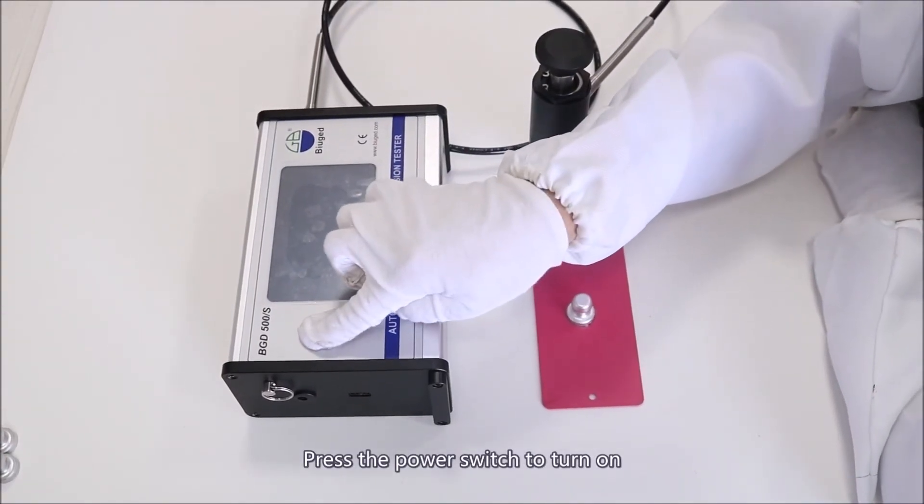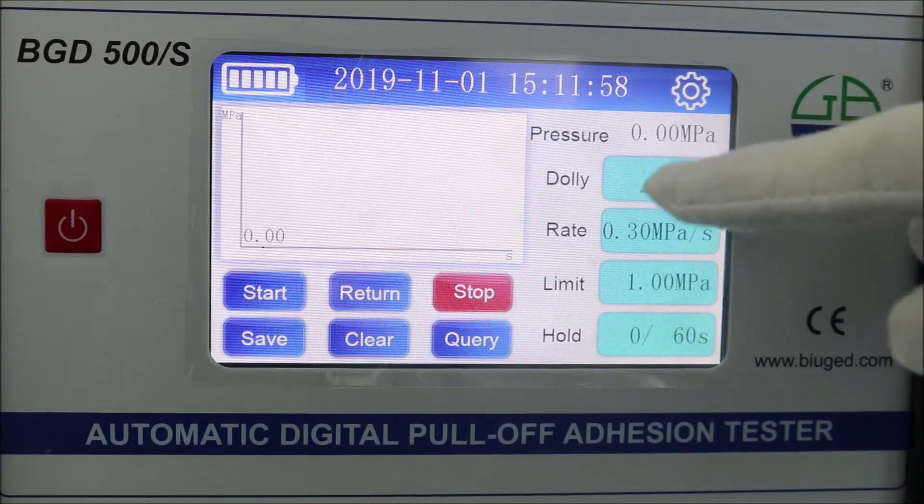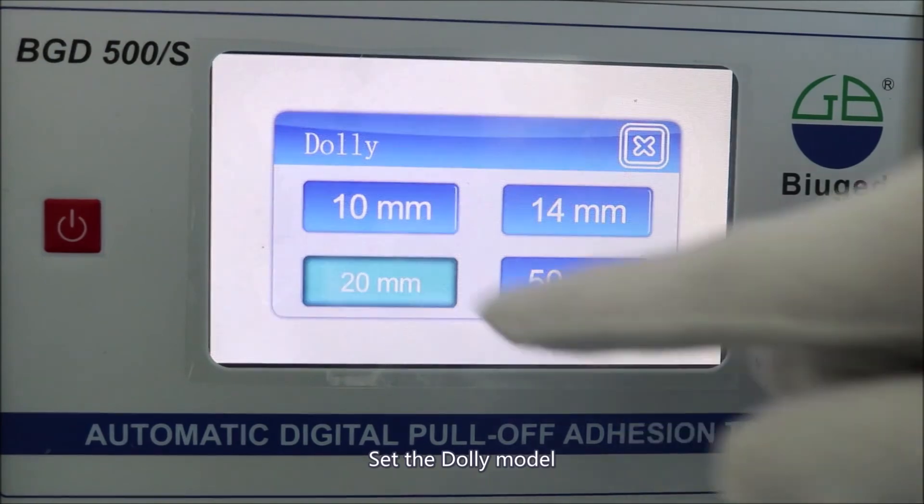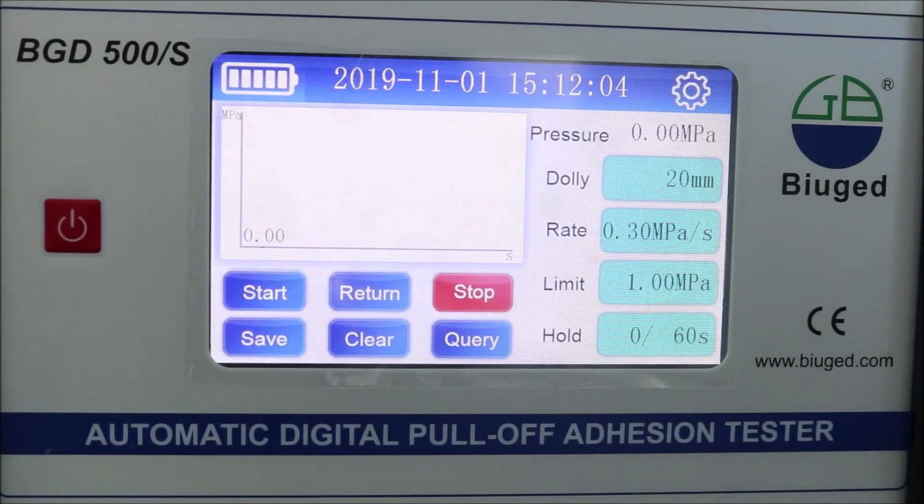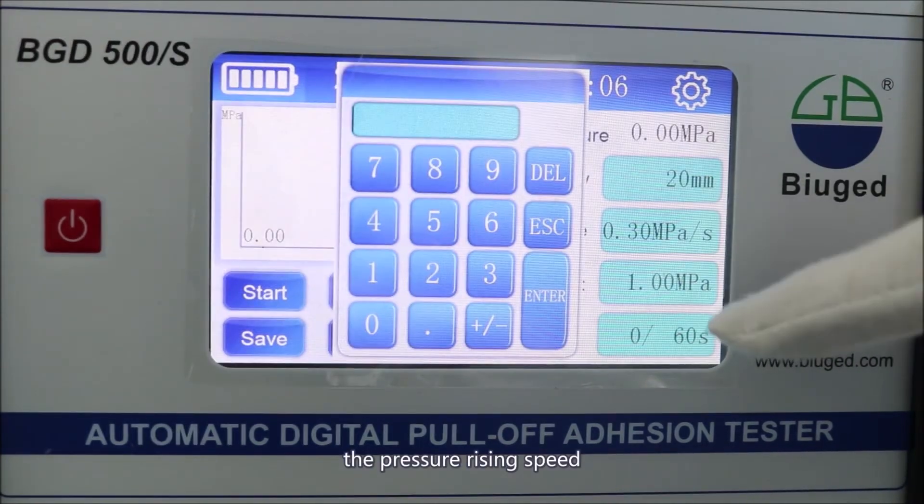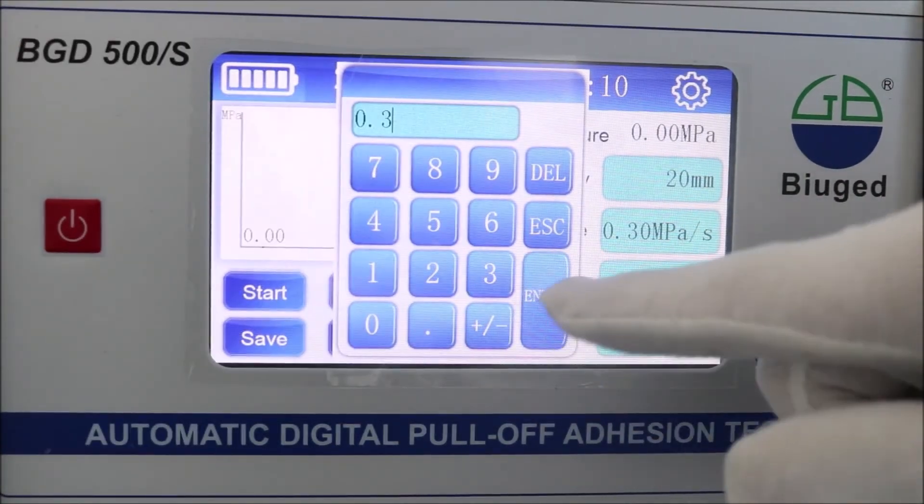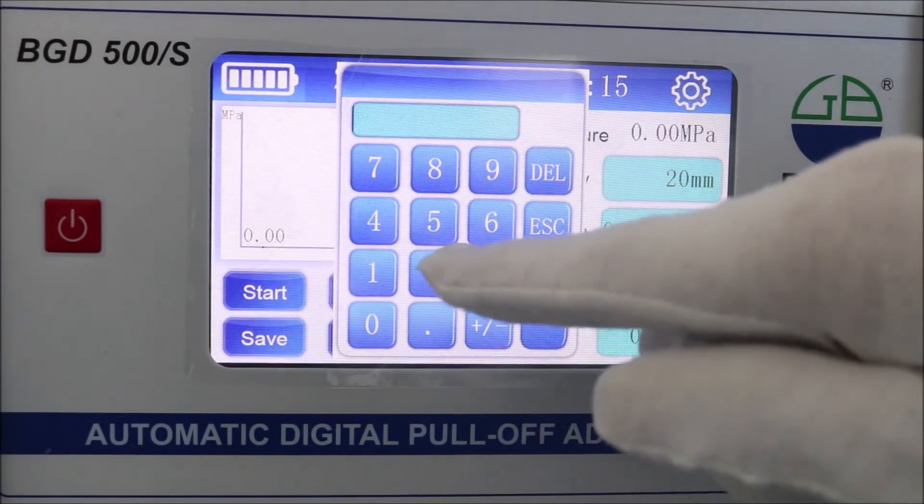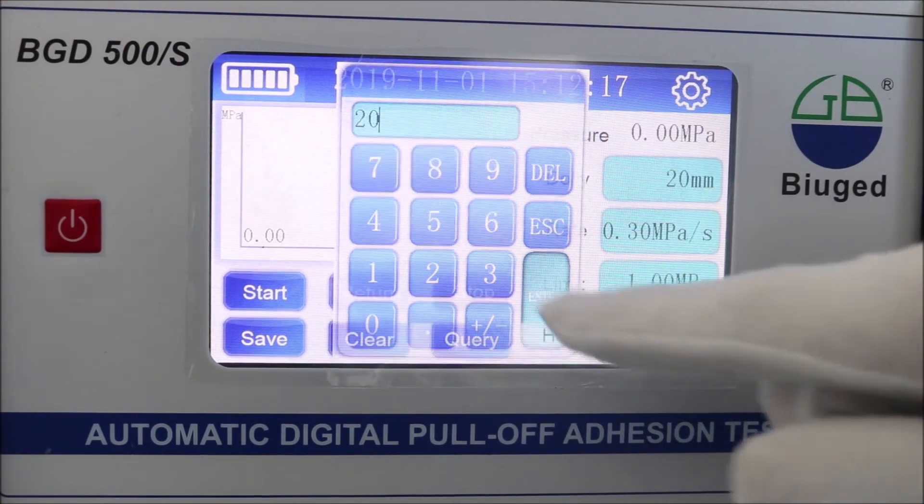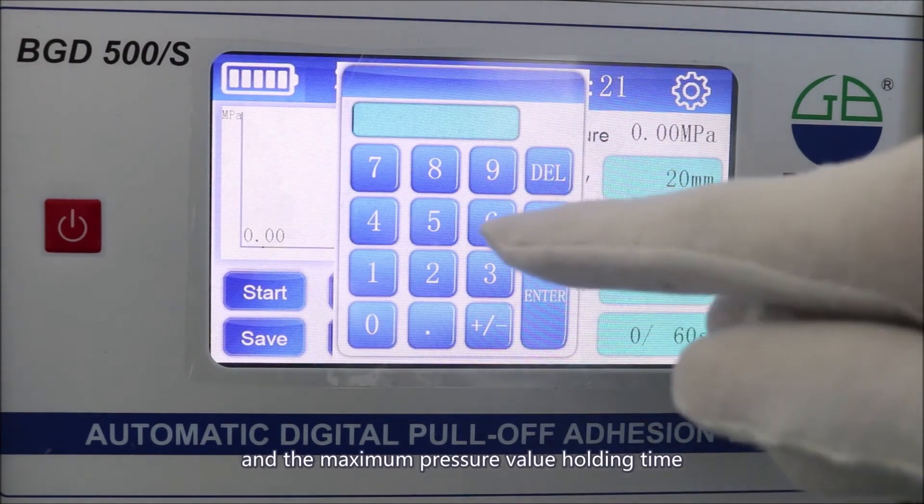Press the power switch to turn on. The screen will light up. Set the dolly model, the pressure rising speed, the maximum pressure value, and the maximum pressure value holding time.